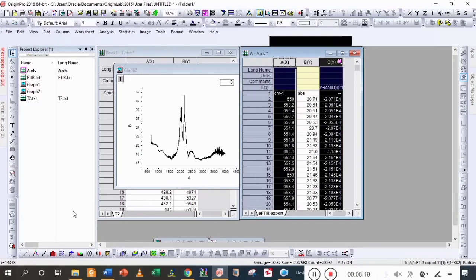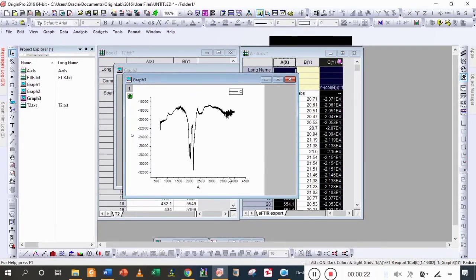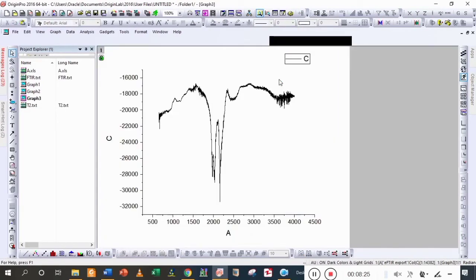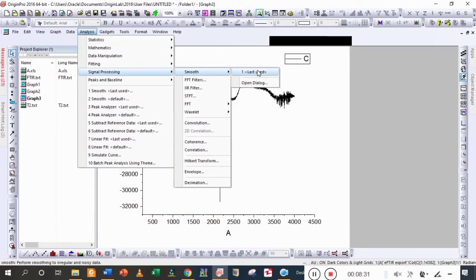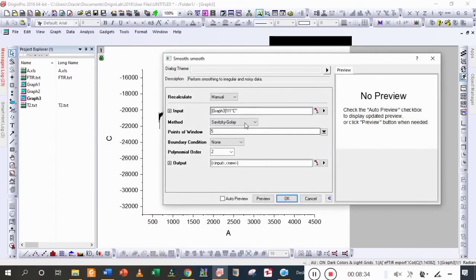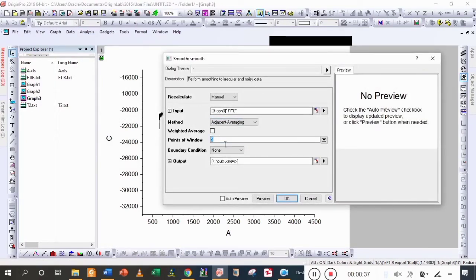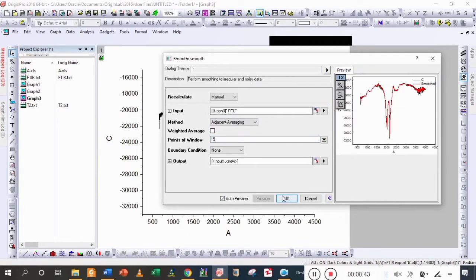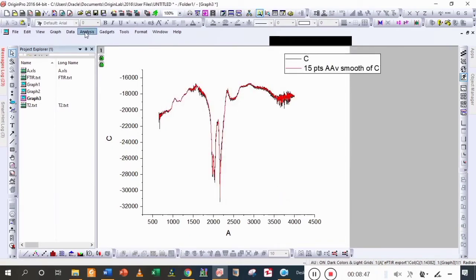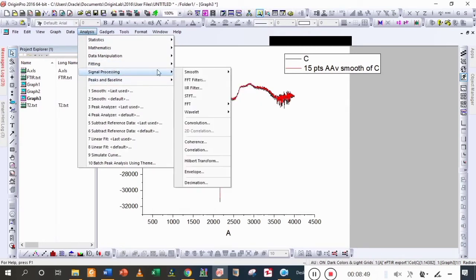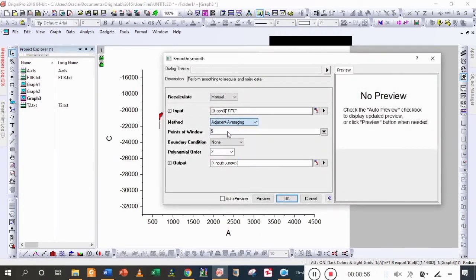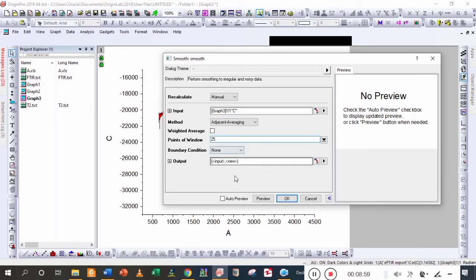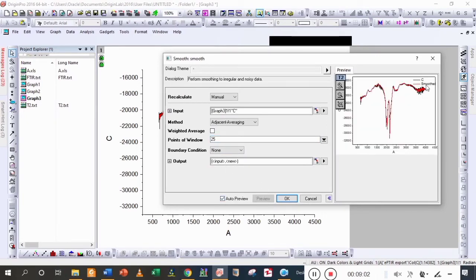We are going to draw it — you can see that the absorbance graph is converted into the transmittance graph. Firstly we will remove the noisy data. Adjacent 15 points, preview — you can see that noisy data is also here, so we are going to again apply a smooth filter. Adjacent 25 points, auto preview.